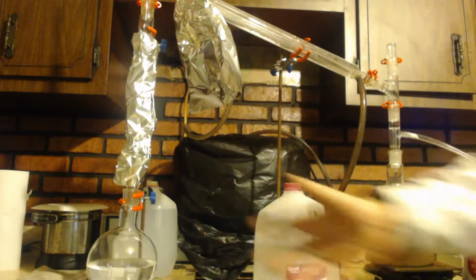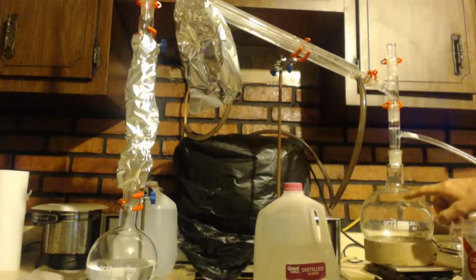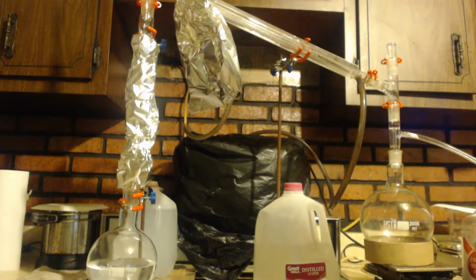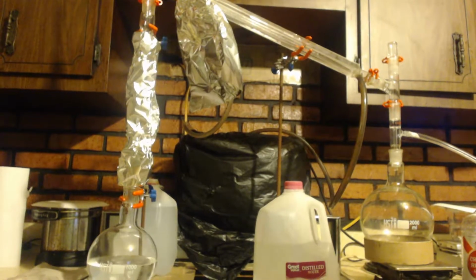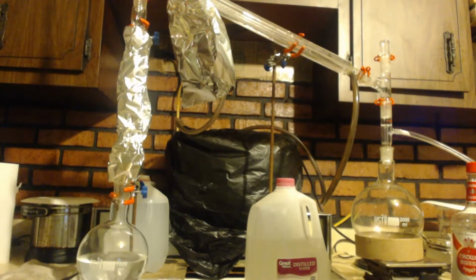The first distillation was done with the same exact setup. The only difference was this was over here, because I was doing a liter at a time, so you need a 2 liter flask, and that's what this is. But you can see, I'm going to distill it a second time. I'll do another density reading, and then we'll use molecular sieves, because I bought these sieves like 2 years ago.